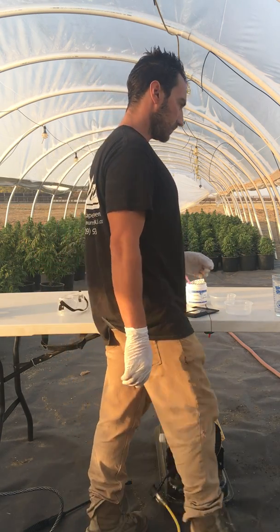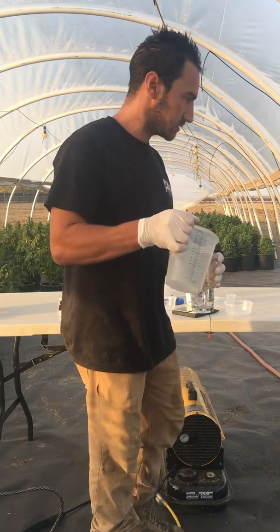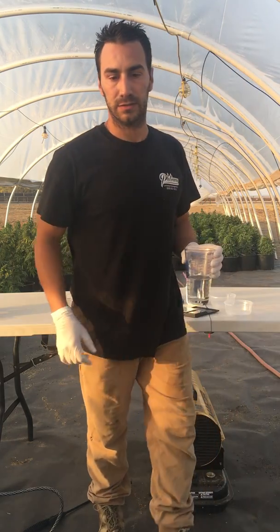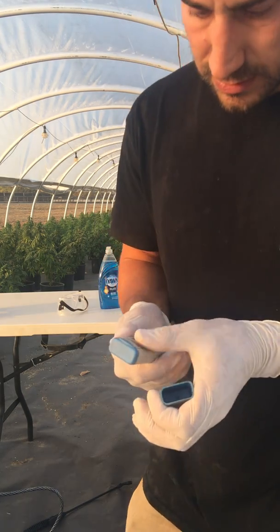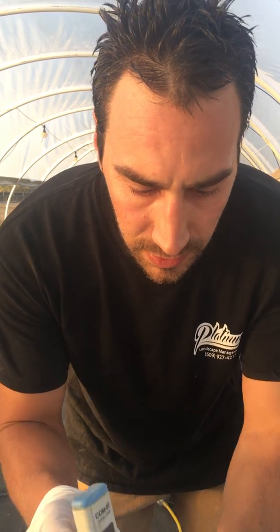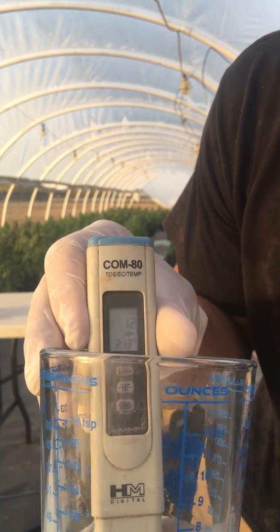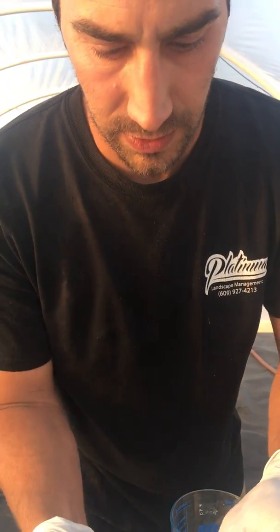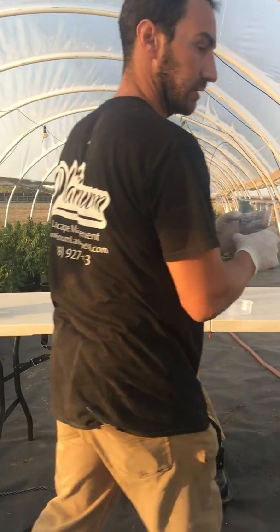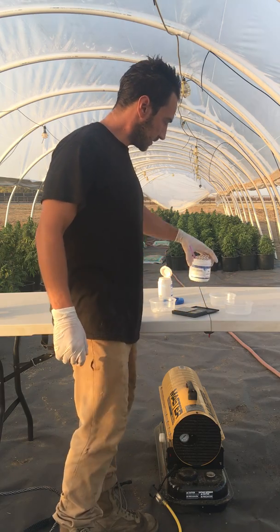So you have this water here — I'm going to put some into this cup just to show you. The base of this water is very low. I'm starting with water that has, I don't know if you can see that, 12 parts per million — very low, very clean water. That is one of the first steps.